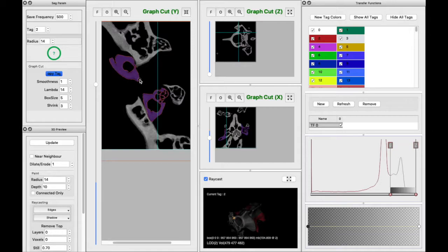Ooh, and where did that start? Okay, like right here. I think I'll just go for the erase instead of doing R. I'm just gonna paint all of the area that it bled over into with 255, and then I'm just pressing the P to confirm that I don't want any of the tag that is underneath it. Oh, went a little too far, so I'm going to erase with right click. And see, it kind of grows with each slice. Okay, but it wasn't there for long, so up until there, things were going pretty well.